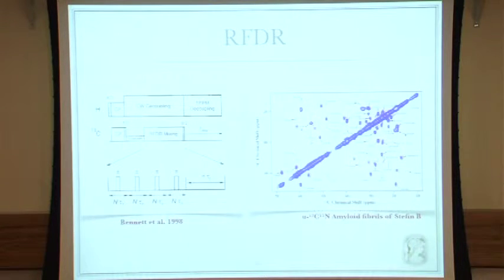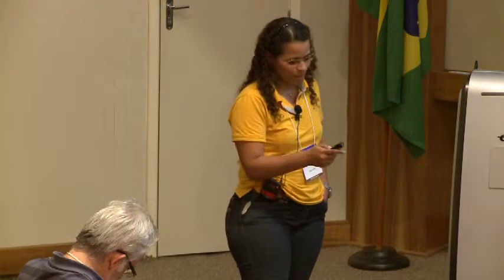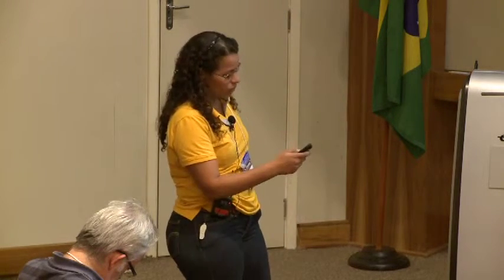Here is some data that I had. You can observe the peaks are really sharp, and this is quite interesting. My sample is not a really common sample. So we have several approaches to label samples. It's a bit complicated to work with huge complexes, so in general we need to decrease the degree of complexity.